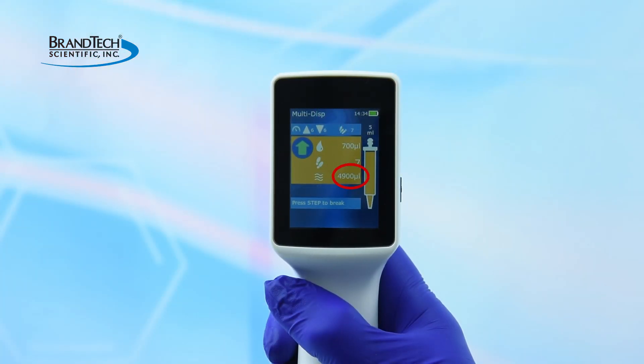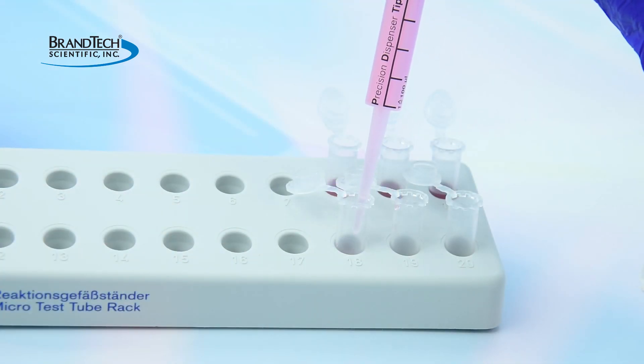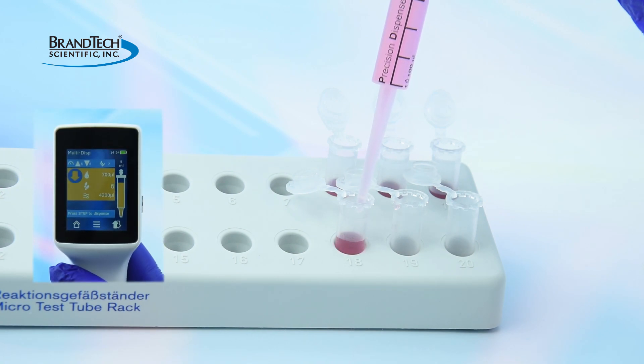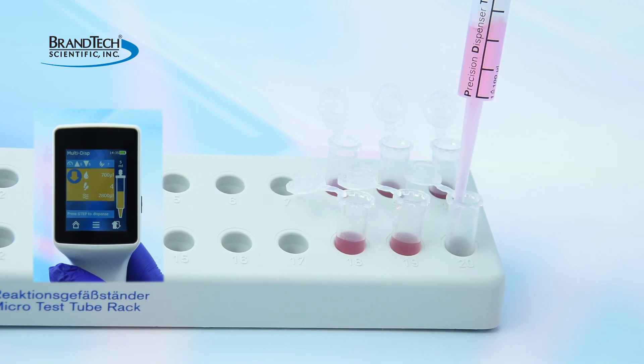The operating screen displays step volume, number of steps, and approximate volume in the PD-Tip. Press the step key to dispense. The operating screen gives real-time feedback of the instrument status, number of steps remaining, and the approximate volume remaining in the PD-Tip.